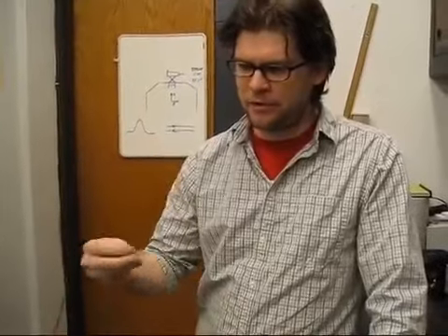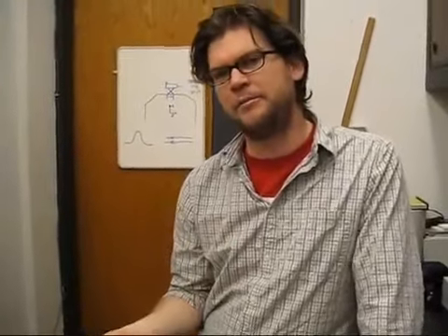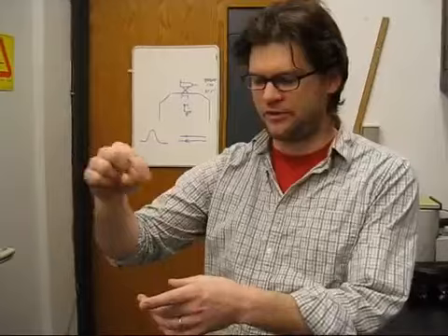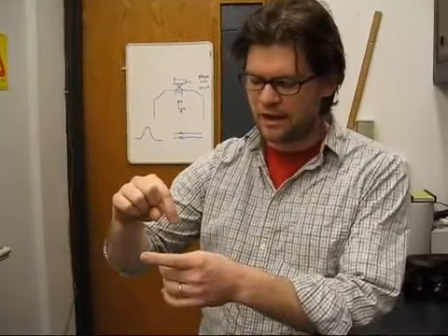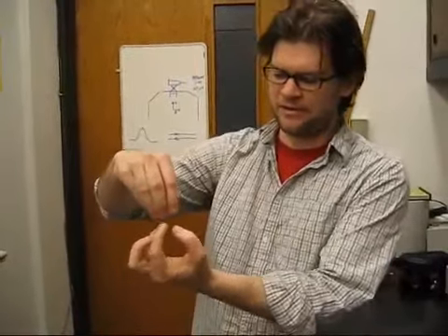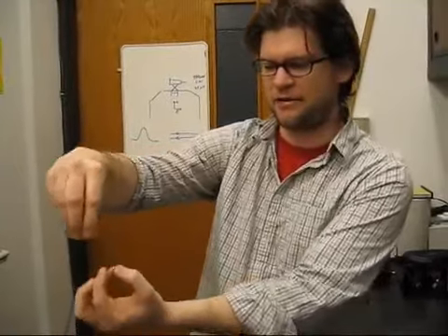To beat that, we use a trick called near-field optics, near-field scanning optical microscopy to be specific. What we do is take that focus spot and insert a probe into the spot, and the probe itself absorbs the background laser light or illumination source and re-radiates it out as a very little spot right at the very end. That little spot is what we use to image. We'll lower the background level of the light so that it doesn't affect the sample. Then we'll take this probe that's carrying a very high field and drag it around the sample, and we'll get these high resolution images.